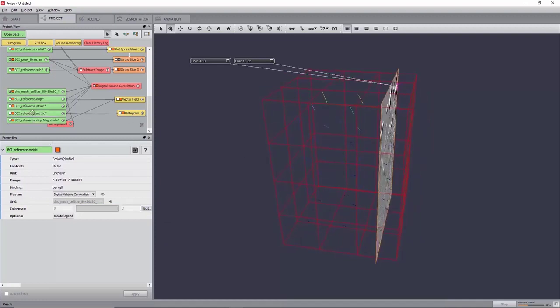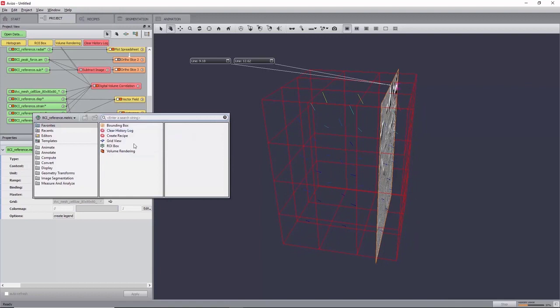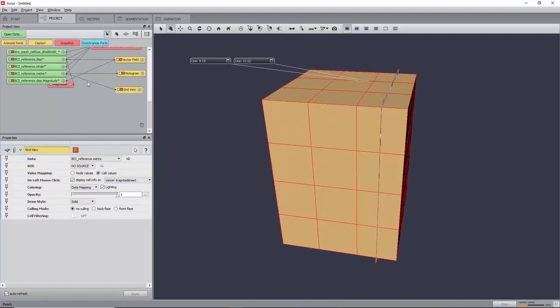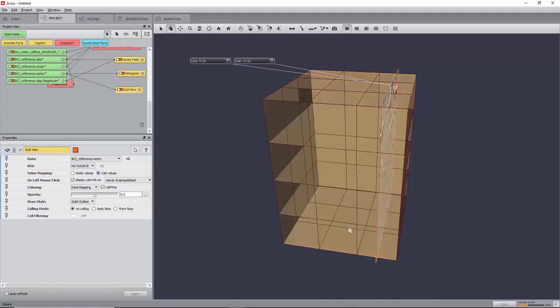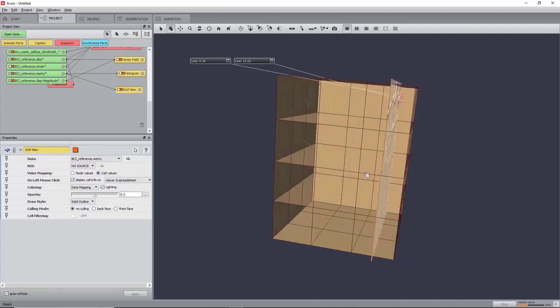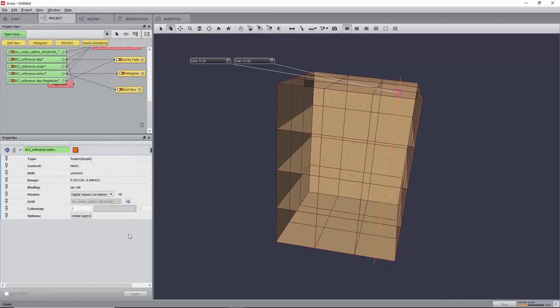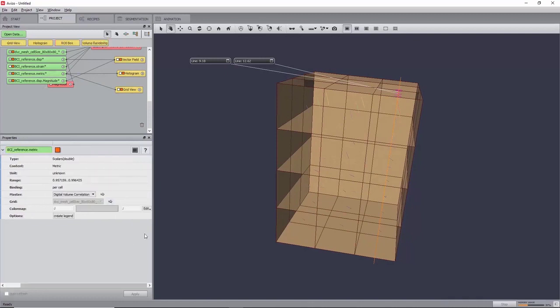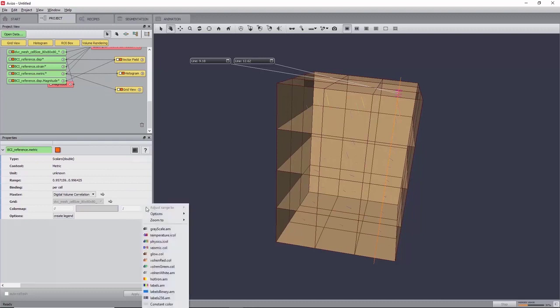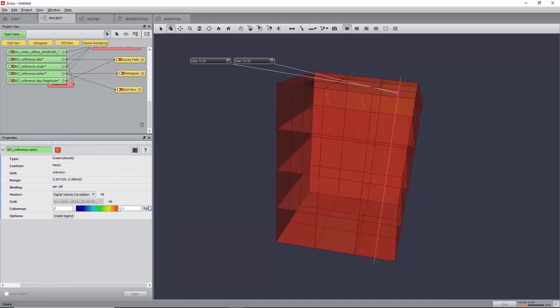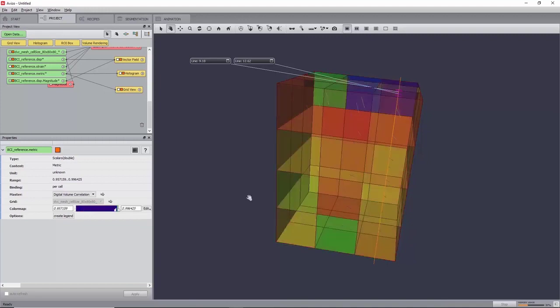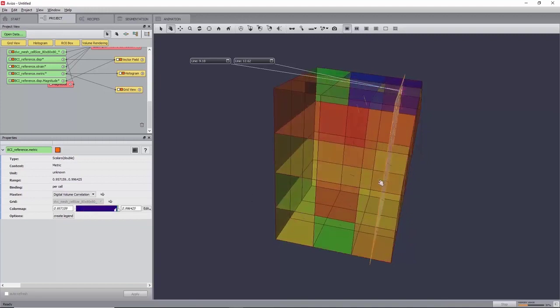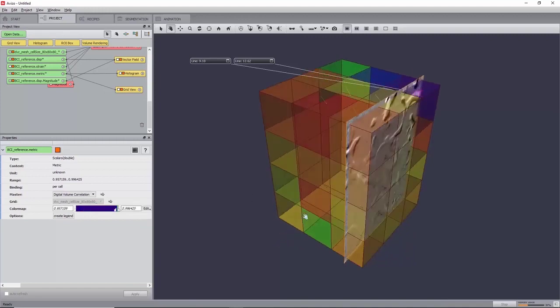You can now visualize the 3D render of the metric value with a grid view, setting colouring to data mapping, opacity to 0.5, and value mapping to cell values. For data fields resulting from the DVC module, the colour map used for visualization is adjusted in the colour port of the data field itself. Here, select BCI reference metric, set the colour map port to physics.am, and adjust the range by clicking on Edit, adjust range to BCI underscore reference dot metric.